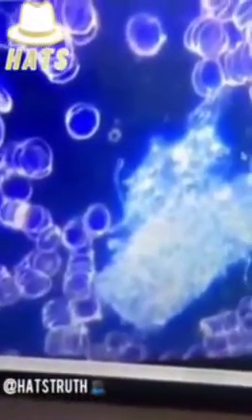Again, okay, what are we looking at? Yes, you see a similar thing, with these things growing out of it. Yeah, because these things were growing. If you wait another couple of hours, I don't know what they would do. They were definitely growing. So they're alive. It's sort of got a life of its own. Definitely something alive. Was it moving live?